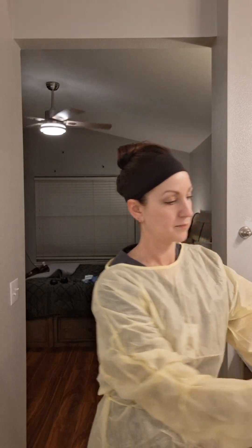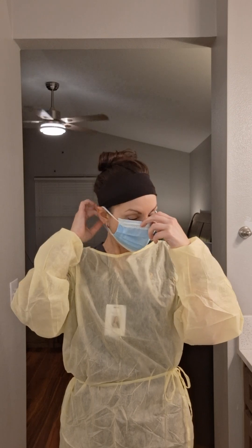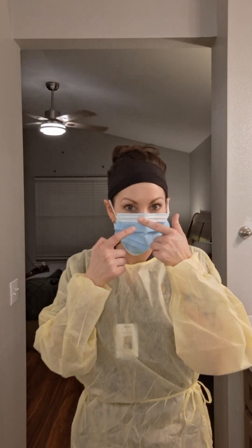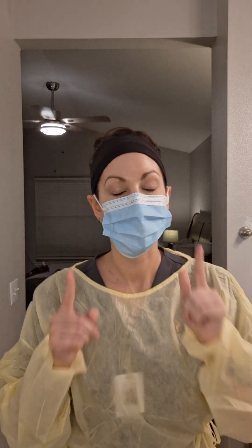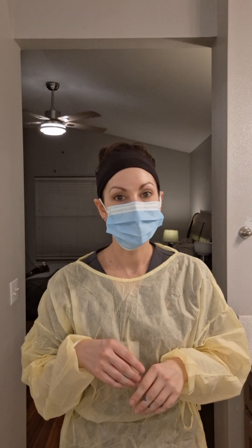Now we put on our mask around the ears, over the mouth. There's a little strip that you will press down so it securely fits. Depending on the type of isolation, a surgical mask or a respirator would be appropriate.